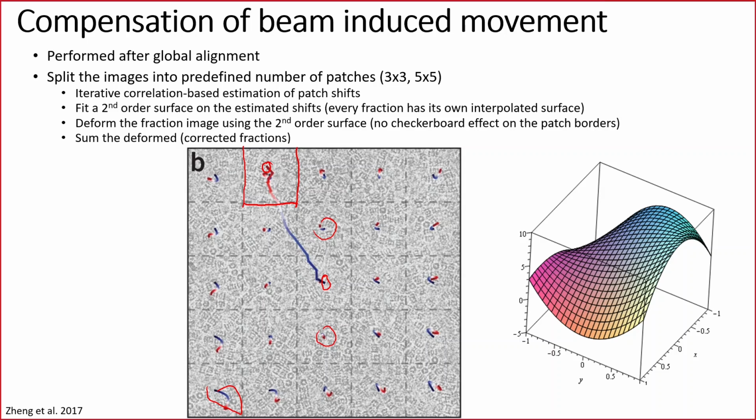This local patch alignment works exactly the same as the global one, so it's an iterative process that ends until we define the limit.